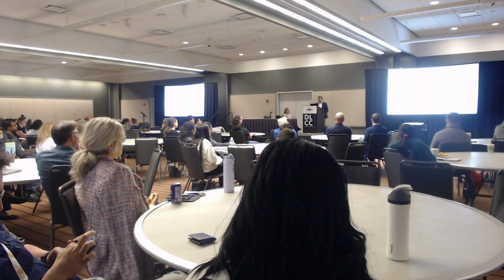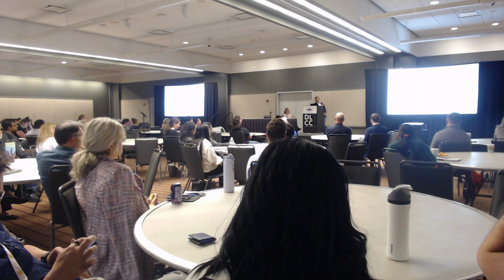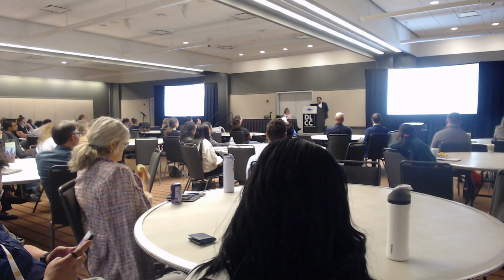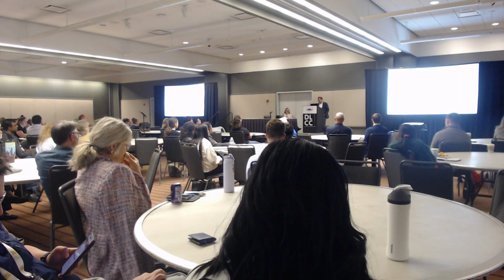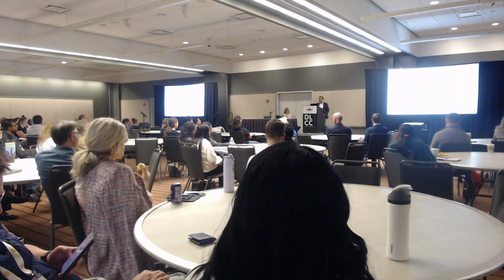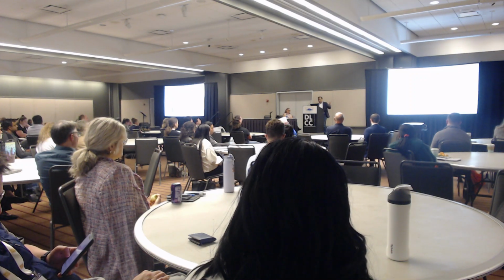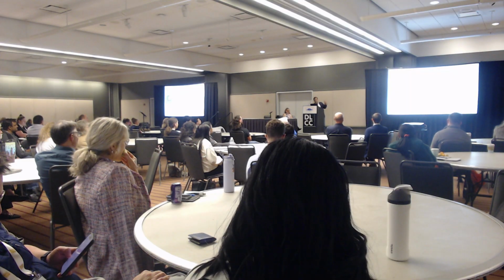And now we are going to be partnering again with Atlas Exomics, and we have a lot of interest now based on this initial optimization, which I've shown to my colleagues at MD Anderson. So we are going to do a lot of these, and I think the latest one, which Yanxiang showed, would be more interesting to do multi-omics actually, rather than just doing one. So that's about ATAC. I'm going to spend most of my time on understanding what information chromatin has.